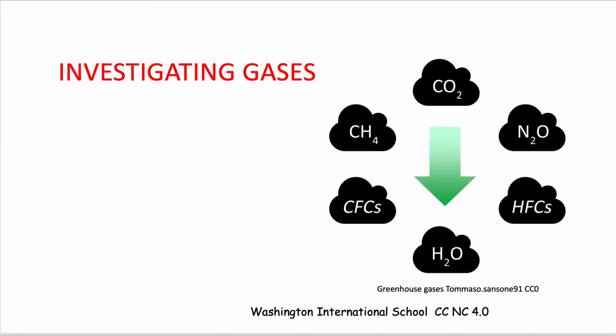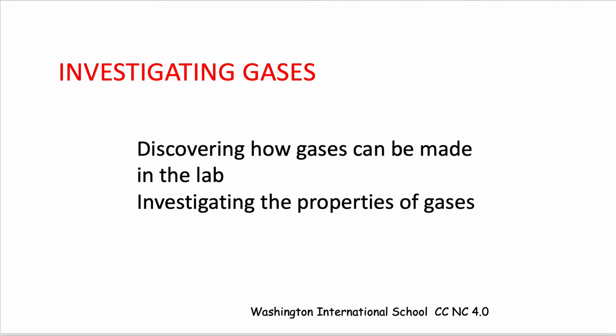So we're going to do some investigation of gases. Not that we're going to investigate greenhouse gases in particular, but you have to know about gases and maybe how to make them and investigate the properties of them before we can understand more about problems like greenhouse gases. And so we'll look at how they're made in the lab and we'll investigate some properties of gases.